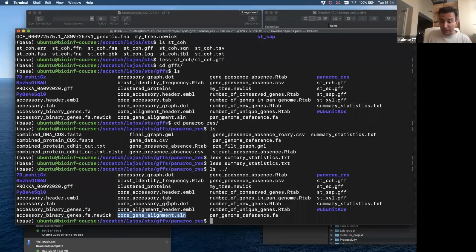And this is only one thing that you do, but the other thing is, especially if you are looking at different phenotypes, I will also try to make a dummy phenotype annotation file for Thursday, so we can see how you can group your isolates by some kind of phenotype.